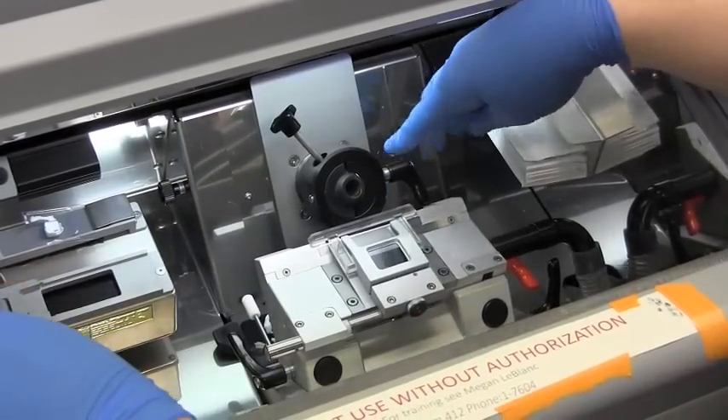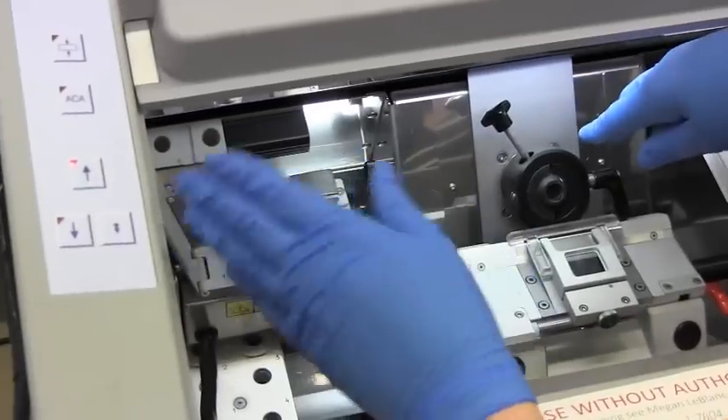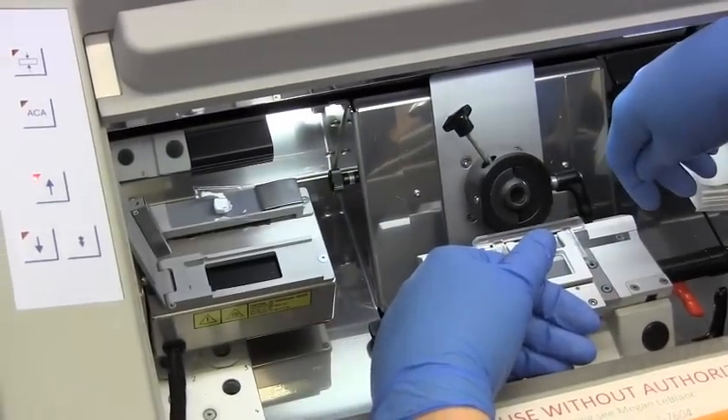Once that's off, move the carrier back as far as it will go. You can hold the button down and then after a few seconds it will just automatically pull it backwards.